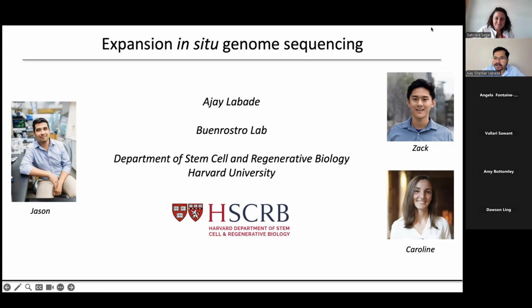Today, I'm going to talk about a technology called expansion in situ genome sequencing. As you can see from the title, there are two important sections of this technology. One is expansion, which refers to expansion microscopy, and the second one is in situ genome sequencing.